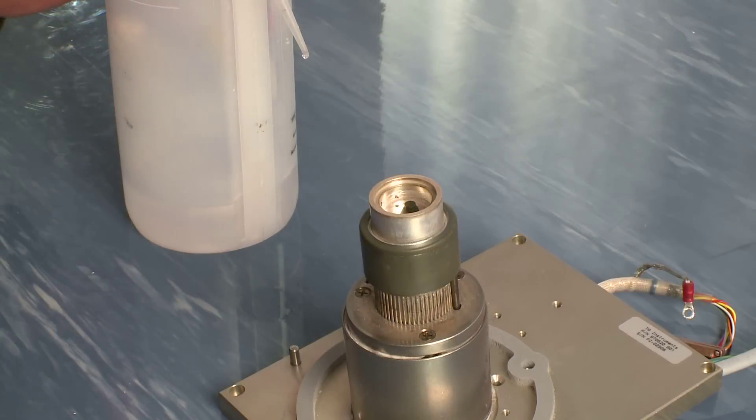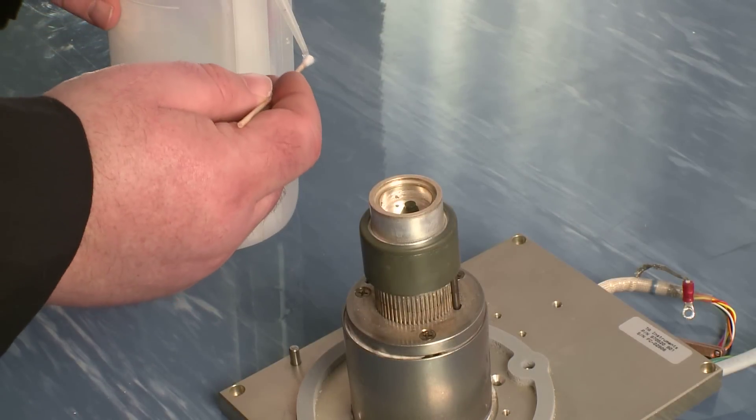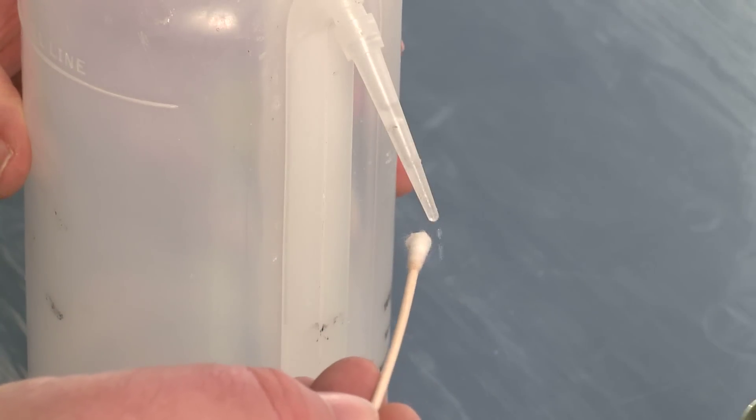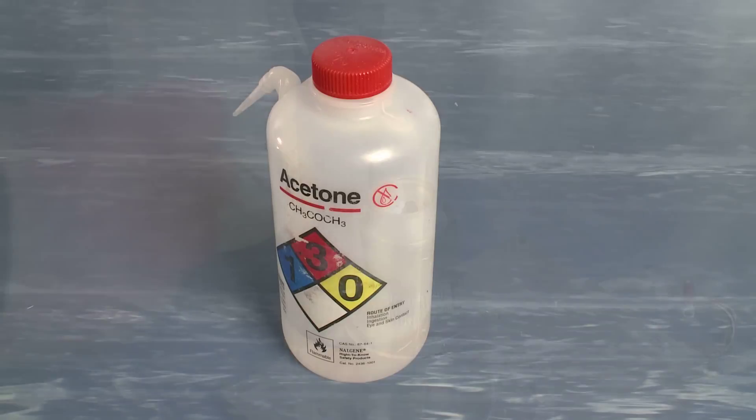Sometimes contaminants can be more persistent and the brush may not remove it completely. If this is the case, we suggest using a cotton swab moistened with a mild solvent to remove the contaminant. You can use acetone, alcohol, or hexane as a first pass.